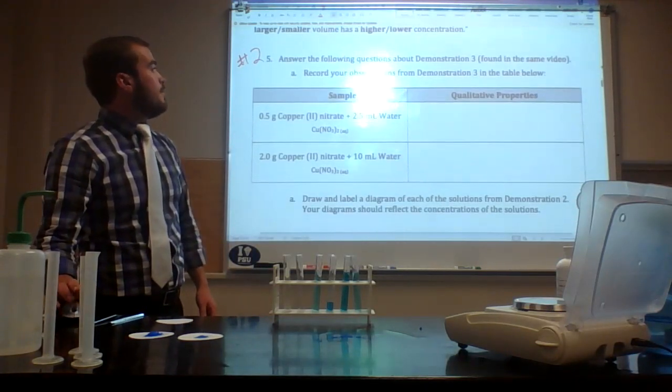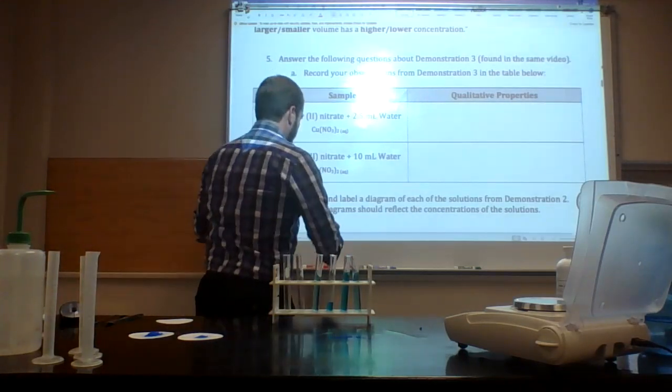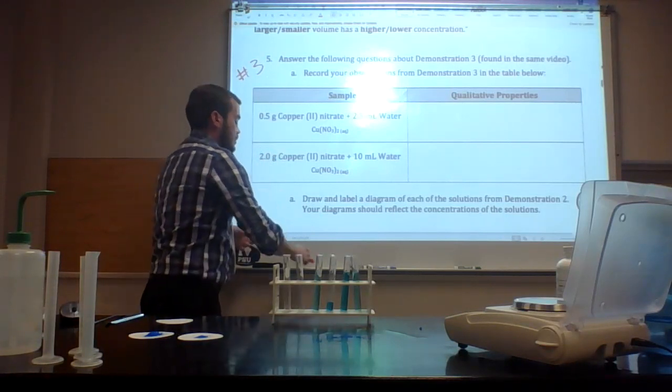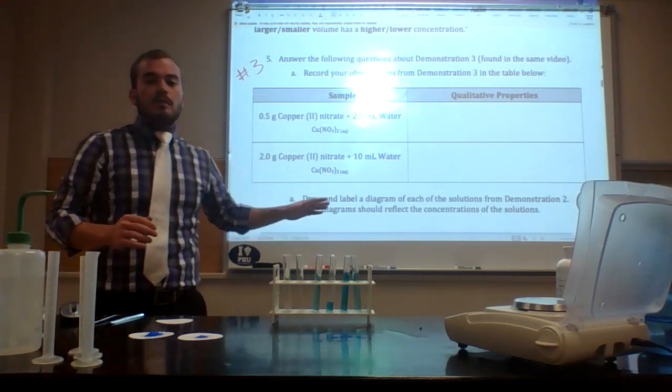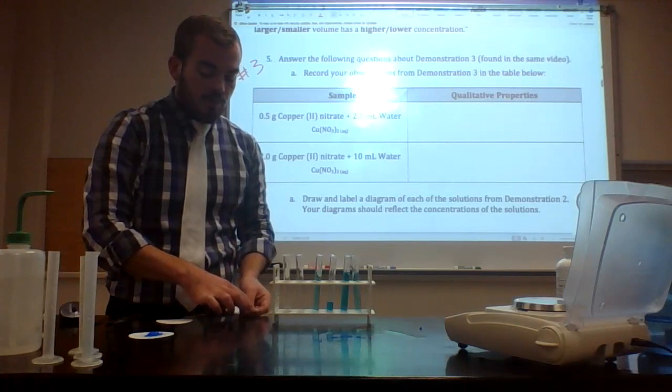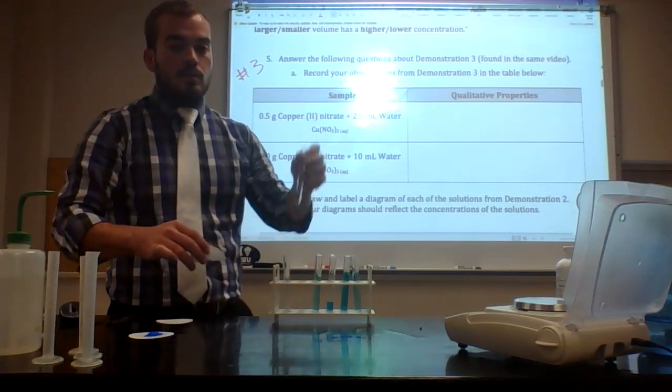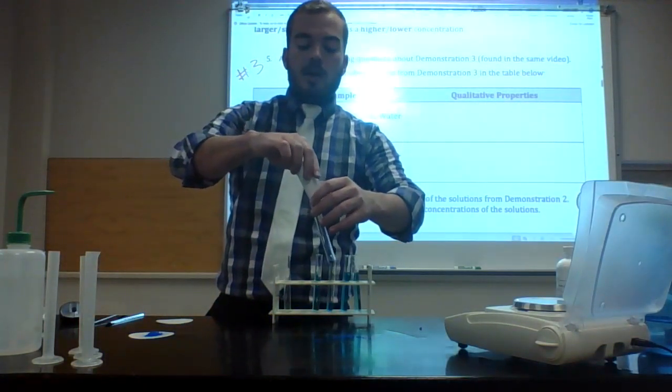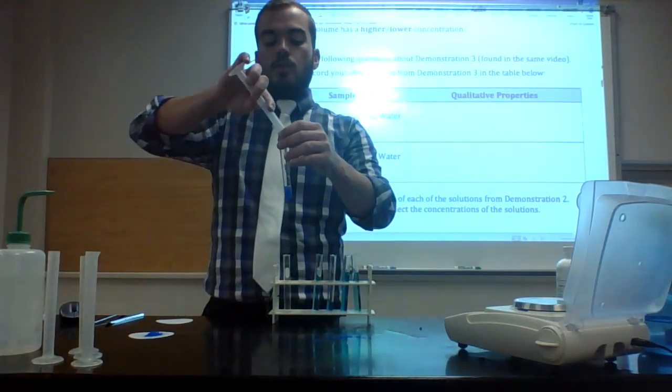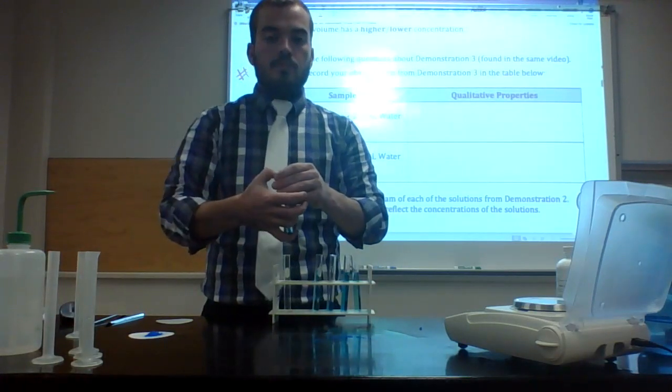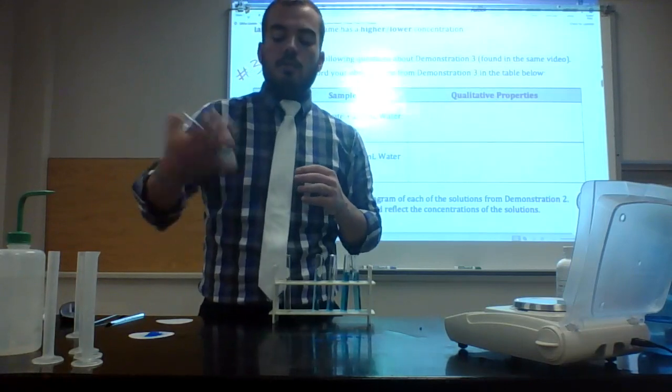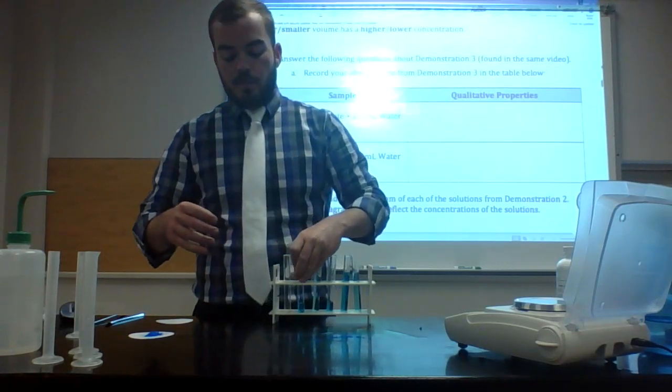And then finally, demonstration number three. This one, both solutions will have a different amount of solid and a different amount of water. First solution is going to contain 0.5 grams of copper(II) nitrate and 2.5 milliliters of water. I'm not going to show you this one until we compare them, just mix them together.